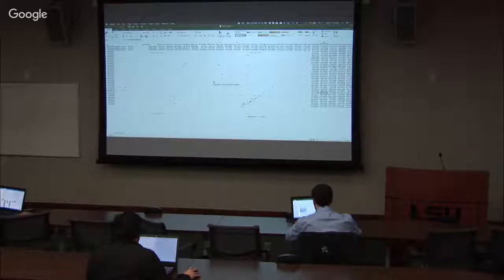So scroll down, and now continue. Start. Can you just look up the number and hold on? Now, you remember here we did transformation to logarithmic scale, so yes. And the threshold, do you remember where the threshold was? 5%. Yes. Just change it to 5.